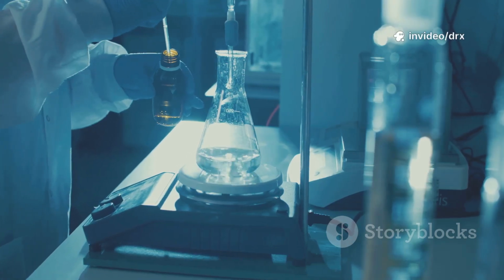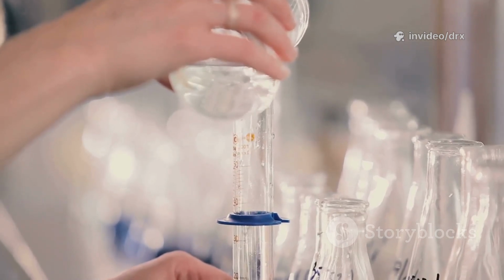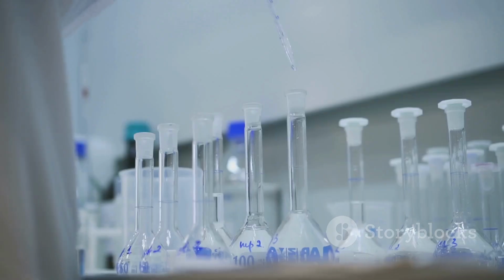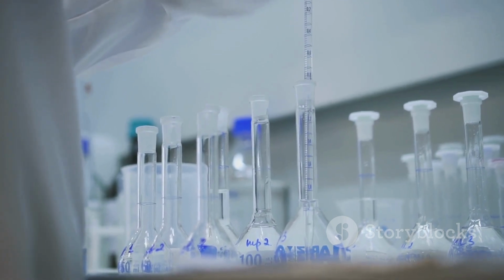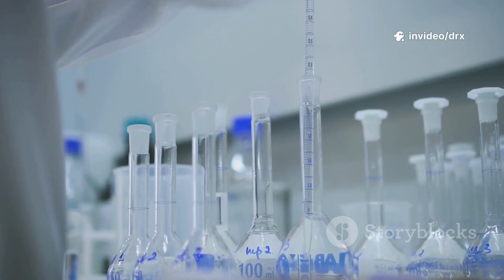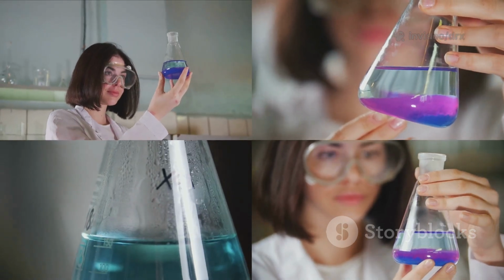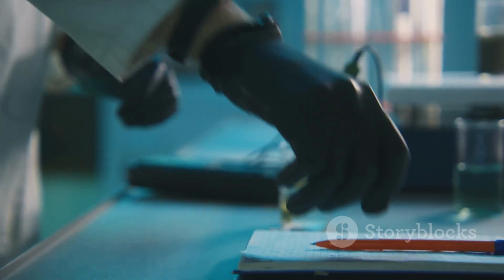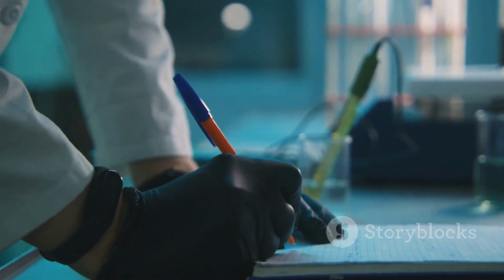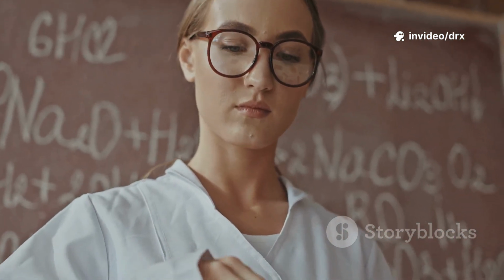Let's quickly run through the procedure. First, I rinse and fill my burette with the standard solution, could be NaOH or HCl. Then, pipette a measured volume of the analyte into a conical flask, add 2 to 3 drops of indicator, and titrate by slowly adding the titrant, swirling constantly. As soon as the color change stays, that's my endpoint. I note the initial and final burette readings and repeat for concordant values. For calculations, I use the formula N₁V₁ = N₂V₂, or M₁V₁ = M₂V₂, simple and efficient.